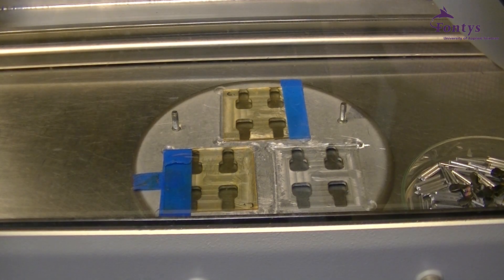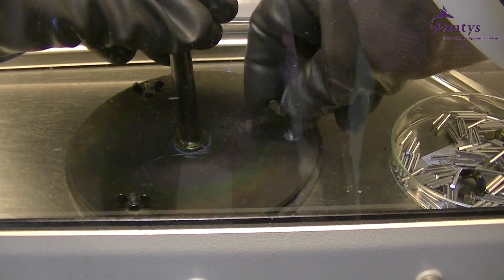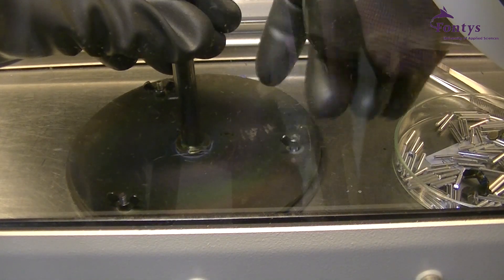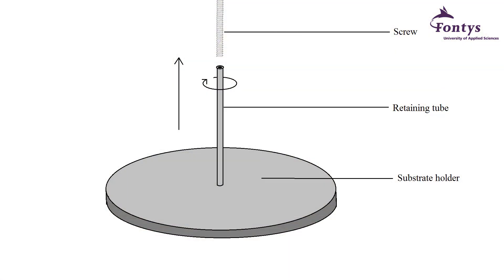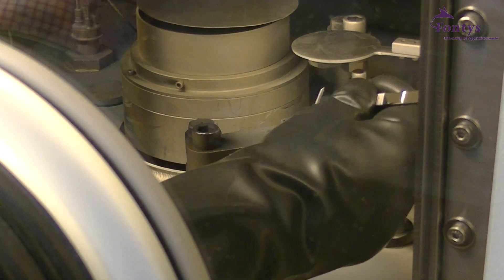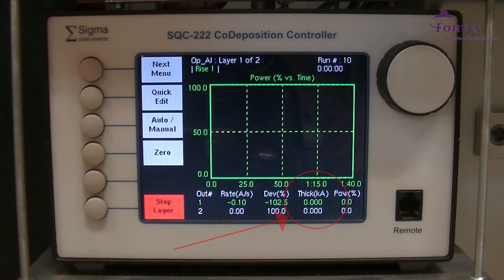Here you can see the right positions of the substrates in the substrate holder. Close the substrate holder firmly. Secure the substrate holder onto the screw by twisting the holder upwards, as illustrated here. Place some aluminum rods on the tungsten plate and close the vacuum chamber. Start the vaporizing process till a layer of 2 kilo-angstrom is deposited on the substrate.